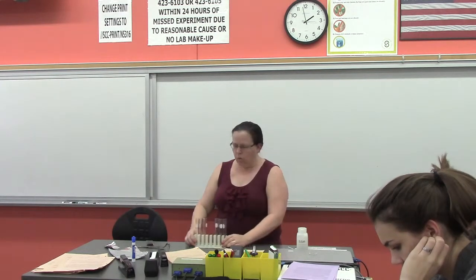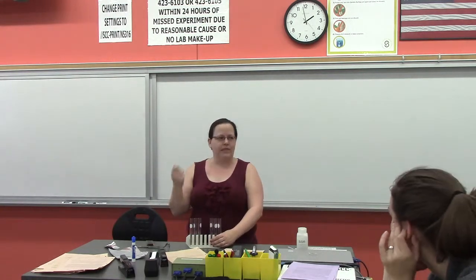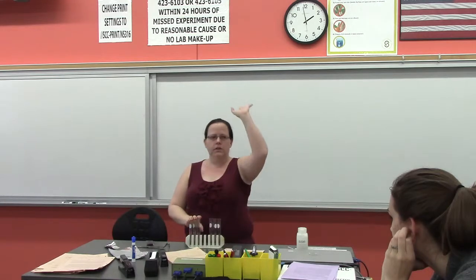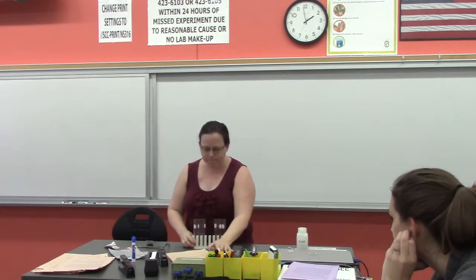Okay? Once that's done, we are again going to want to wash everything. The mineral oil in particular, like any oil, it's very sticky. It likes to stick to the glass. It's going to take quite a bit of soap and quite a bit of scrubbing to clean that oil out. Dump the liquids in the back, wash them, rinse with distilled water. Now you're ready for part C. Okay?